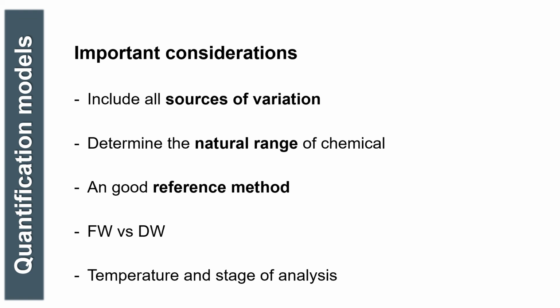It will also be necessary to have a good reference method to obtain the chemical values for the samples. A model will only be as good as the values that you presented. If your reference method is therefore not accurate, one cannot expect the model to predict the values more accurately.